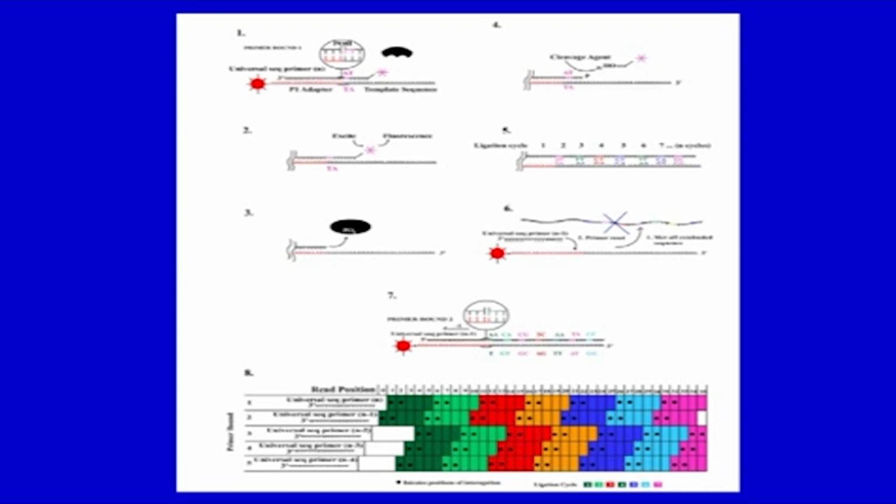This is summarized here. If you can see, this is the original primer, then there is the n minus 1 primer, the n minus 2 primer, and in each cycle there are certain overlaps, like these 2 bases were the first, then the next 2 bases. Likewise, there is an overlap of these sequences, and finally you will get the full sequence as you go. Each time the ligation and priming reactions are performed with primers shortened by one nucleotide, and different probes.